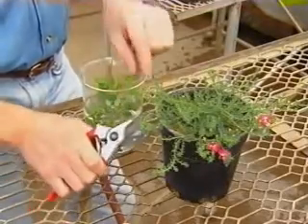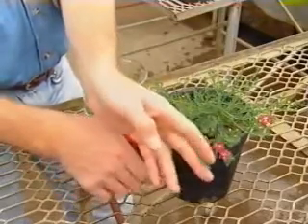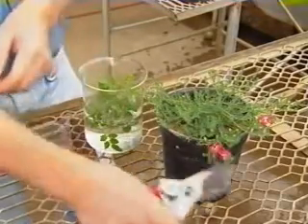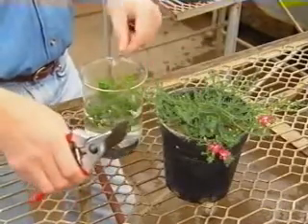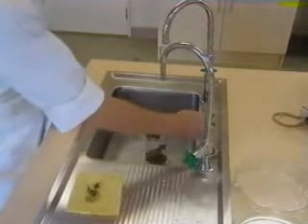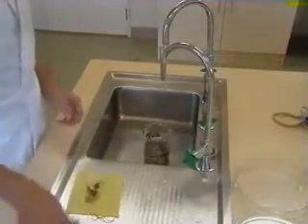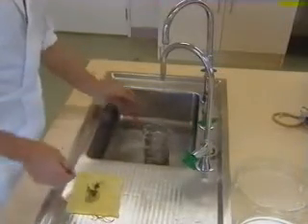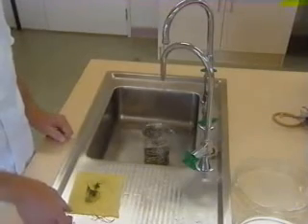The plant material is harvested ideally first thing in the morning when the plant cells are all turgid. Shoot segments, leaves, petioles, bulb scales, etc. can all be used, as indicated before. The plant material then is washed under running tap water for 20 minutes to 2 hours, depending on the source of plant material, that is, whether it is field-grown or glasshouse-grown.